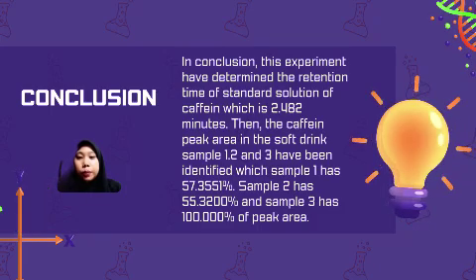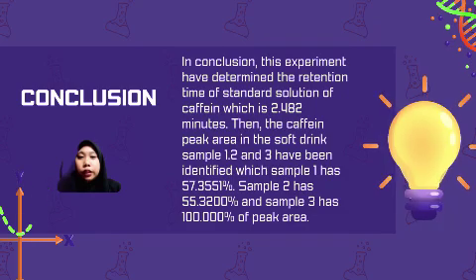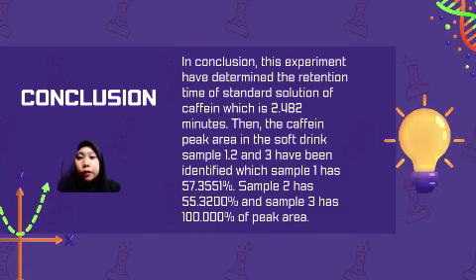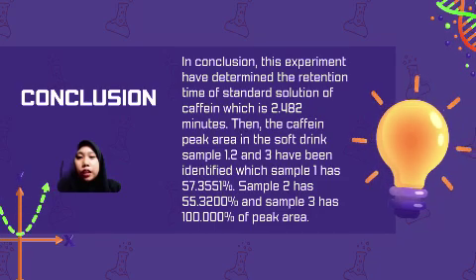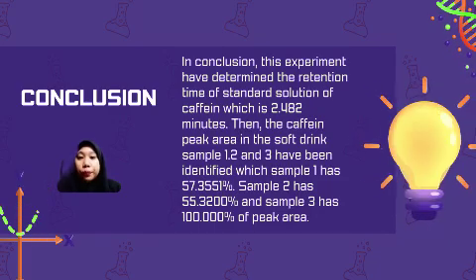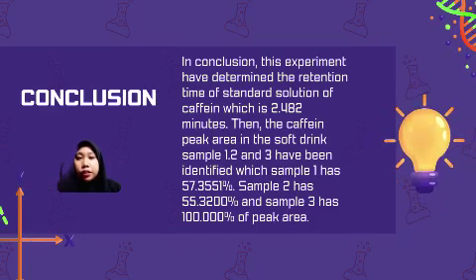Overall, the experiment demonstrates the utility of HPLC in quantifying caffeine content and distinguishing the retention time of caffeine in complex mixtures, like soft drinks. This analysis is crucial for ensuring product consistency and adherence to regulatory standards.